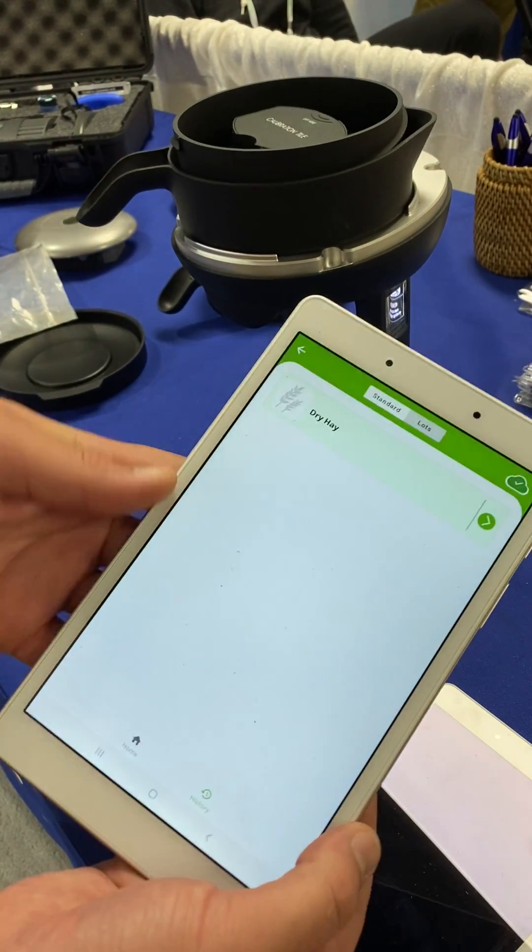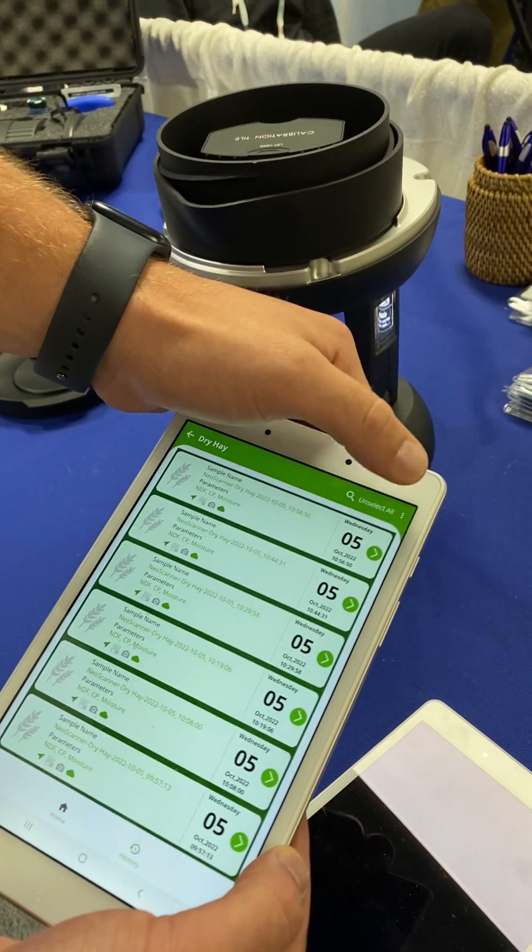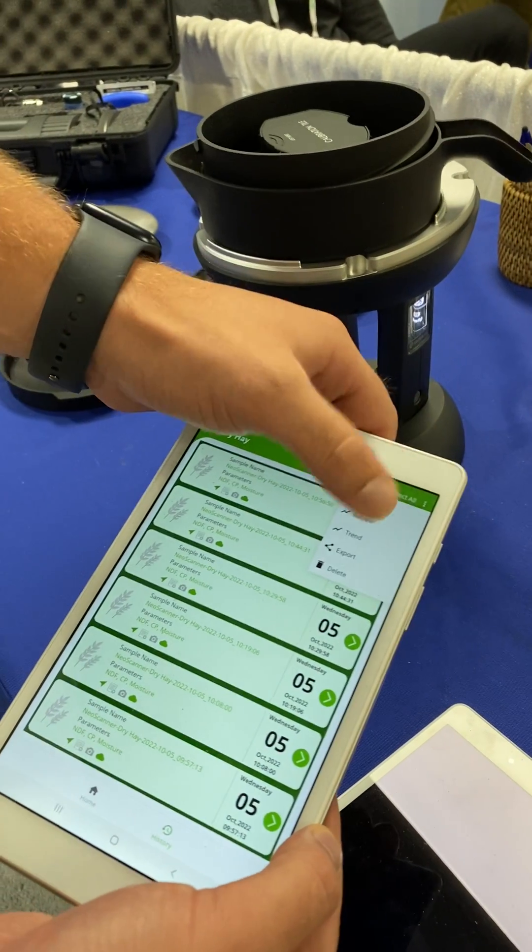While this is going on we can go into our histories tab and look at all of our past scans and check the trend charts for each of the parameters.